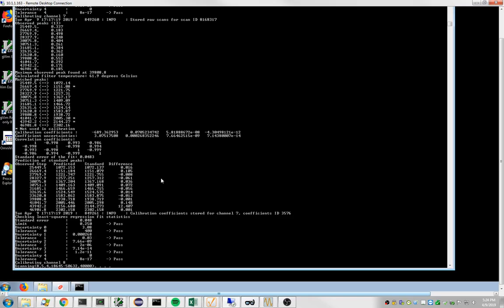Just about halfway down now. I have a 12 channel here in my office. There are a couple of things we need to do after this is finished, so hang in there.